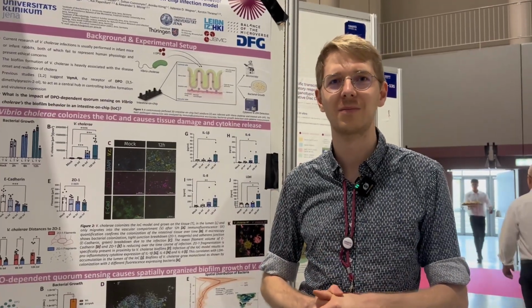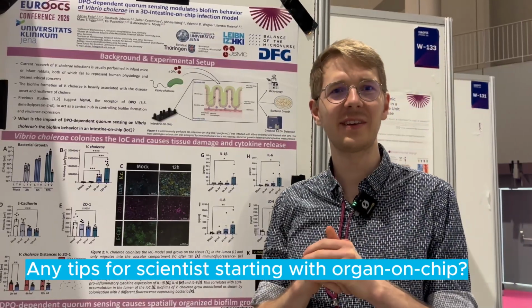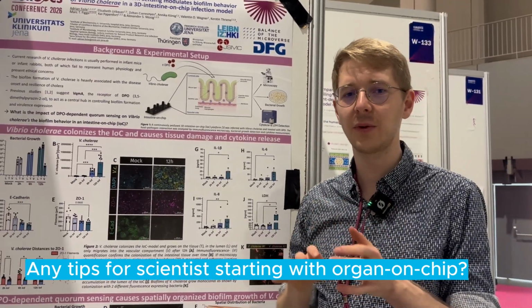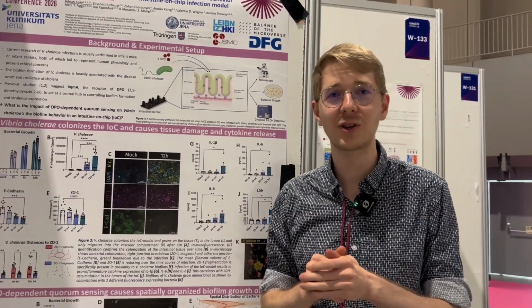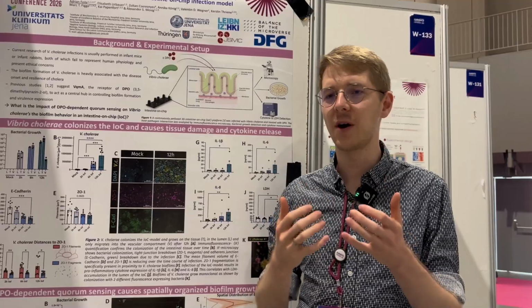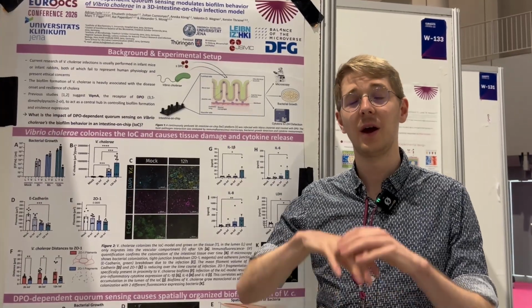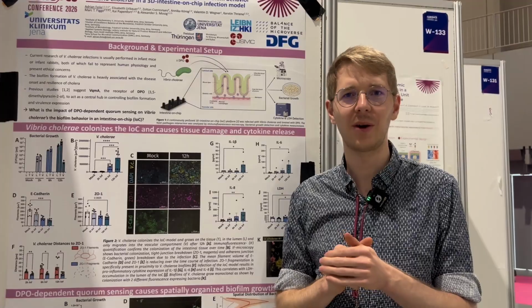When you start with organ on chip, you're first bombarded with all these technicalities, with tubings, with different ports and molecules. So I would recommend to really start simple. Don't start with the biology, just start with adding water to the chip, add all your different components like tubings and so on, and figure out how you can work bubble-free and how you can use the technology in the correct way. And once you have established that, then you can start going deeper into the biology.